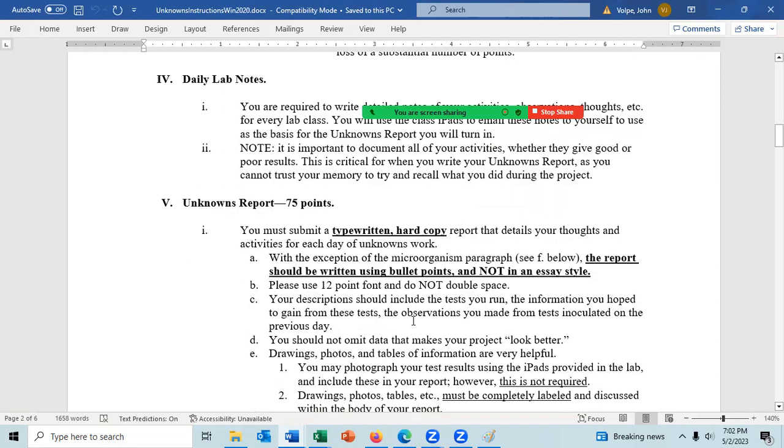On day two, which would be, let's say 5/9, you request a test. 5/10, you got the results. So put in the results on 5/10, and each day should be dated. You don't really need the hour in this one, but I think the unknown notes page does put the hour.